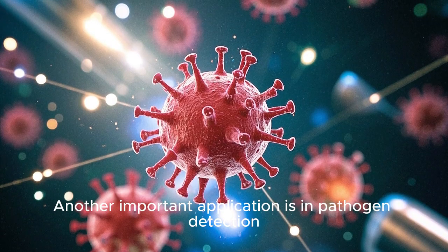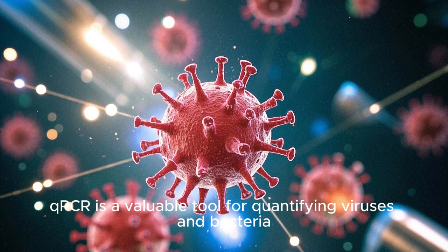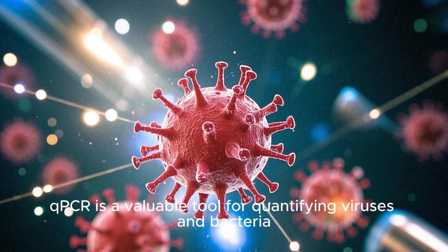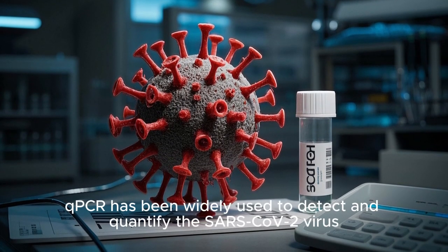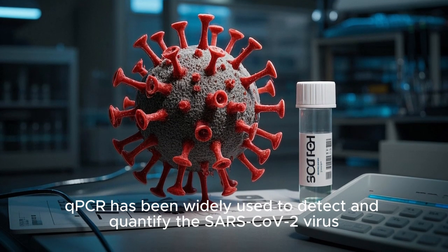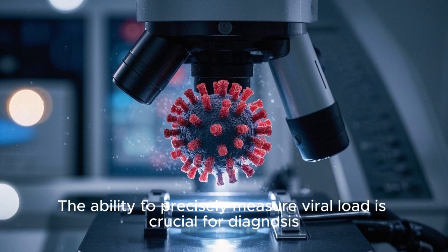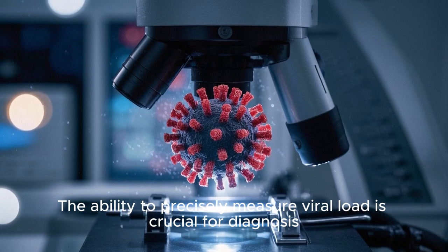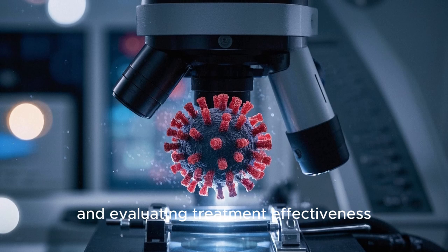Another important application is in pathogen detection. qPCR is a valuable tool for quantifying viruses and bacteria. For instance, in the case of COVID-19, qPCR has been widely used to detect and quantify the SARS-CoV-2 virus. The ability to precisely measure viral load is crucial for diagnosis, monitoring disease progression, and evaluating treatment effectiveness.